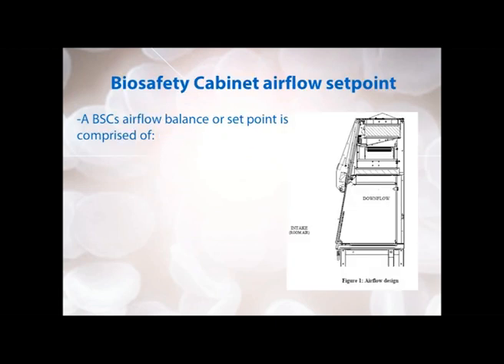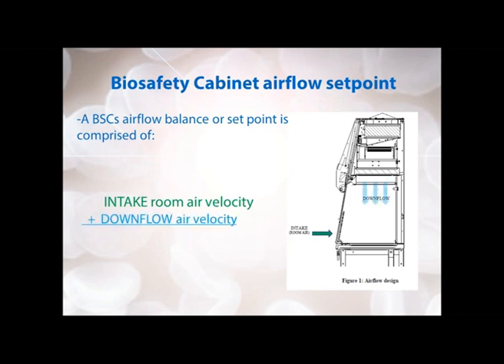In order to understand what intake air is, we're going to discuss the biosafety cabinet airflow set point. A BSC airflow balance or set point is comprised of two parts. First, you have the intake or room air coming in through the open front sash of the biosafety cabinet — so when you have the sash pulled up to its designated height, such as 8 inches, 10 inches, or 12 inches, and how much air is coming in through there.